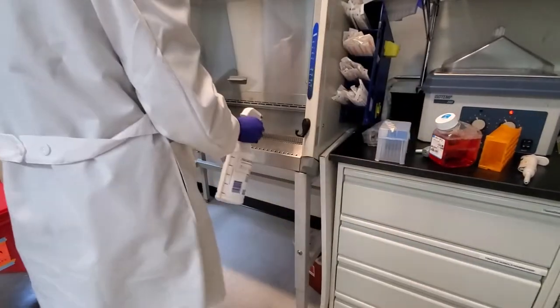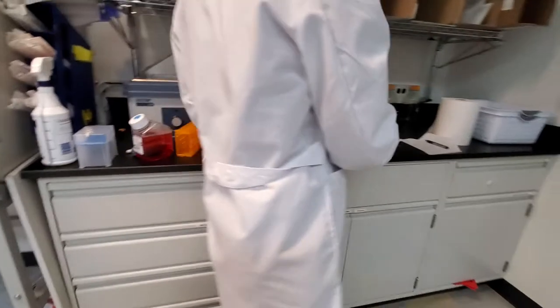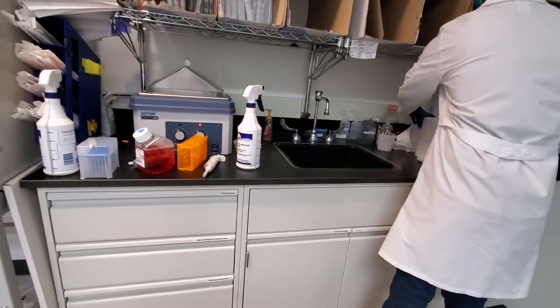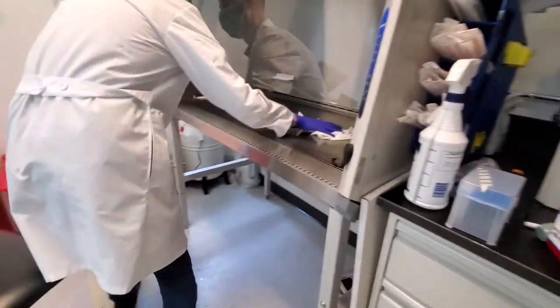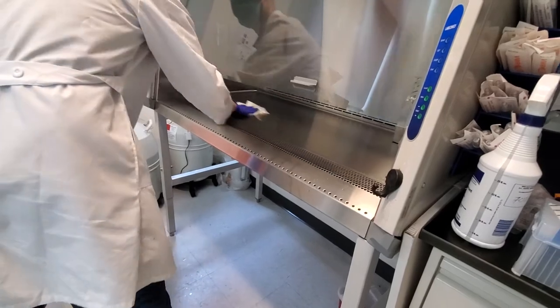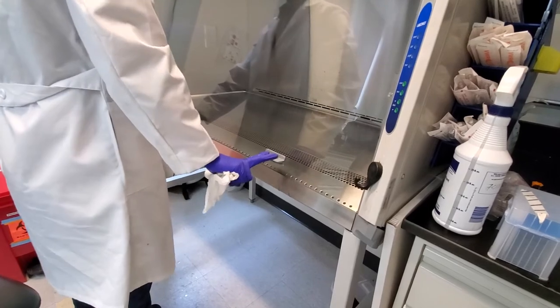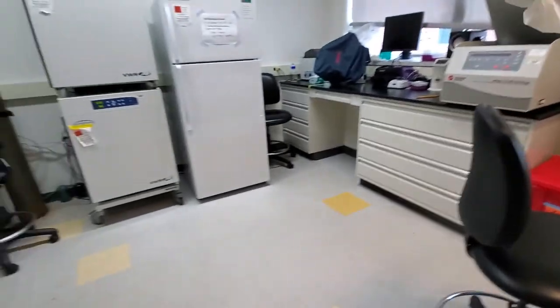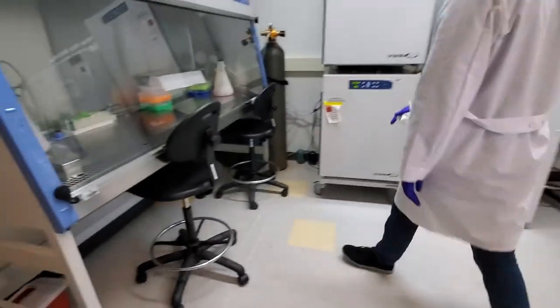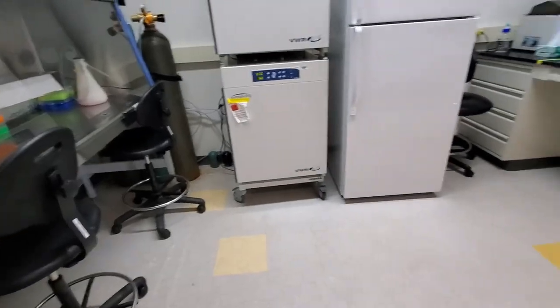Alright, then we're done with the hood, so wipe it or spray it, and then at the end before I close it, I like to wipe it as well. This hood, the UV light comes in automatically. For this hood over here, you have to turn it on manually. I'm pretty familiar with this hood, actually. Oh, yeah? Okay, similar to one you used before? I think it's literally the exact same one, just looking at it.